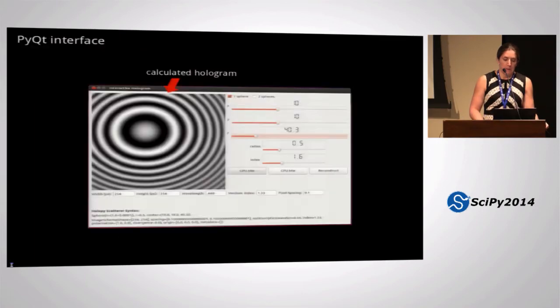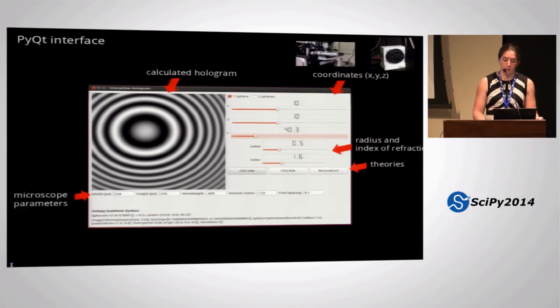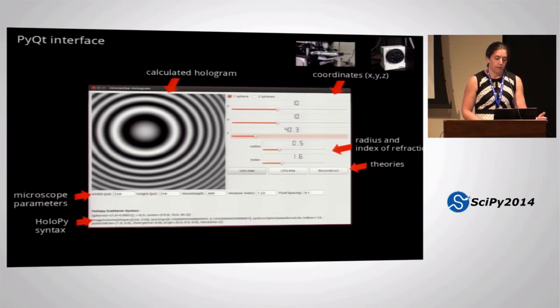So with 20 frames per second, I was able to go ahead and build an interface in PyQt, and I show the calculated hologram, the XYZ coordinates, which are akin to the knobs that I'm used to turning on a microscope, that's how I usually interact with my science, the radius and index of refraction, which is how you characterize the material, the different theories that I want to be able to compare to one another, and parameters about the microscope, like the wavelength of light that you're using, as well as the syntax for how HoloPy describes an object with all of these parameters, so that you can go back to HoloPy and write some scripts.